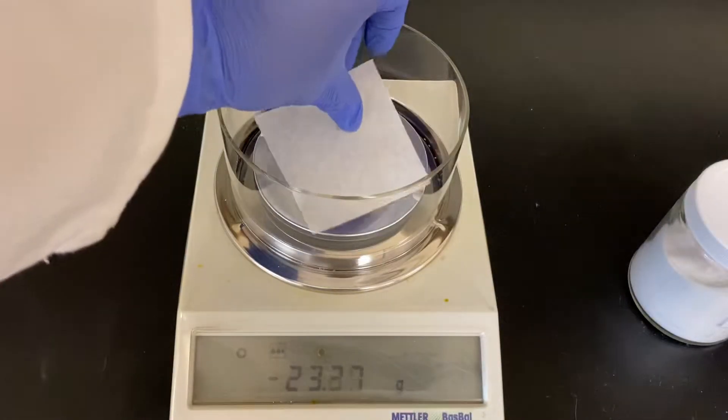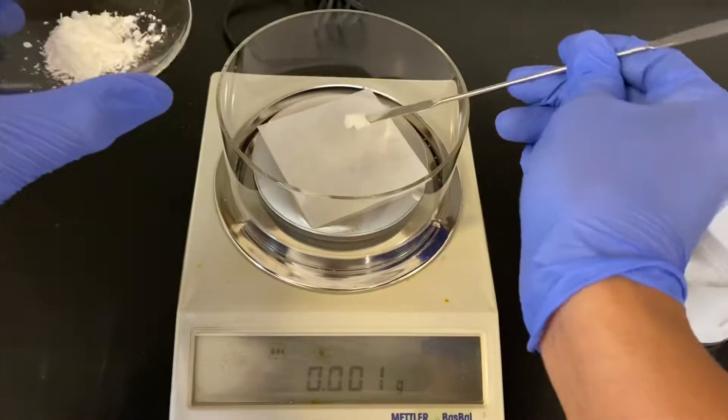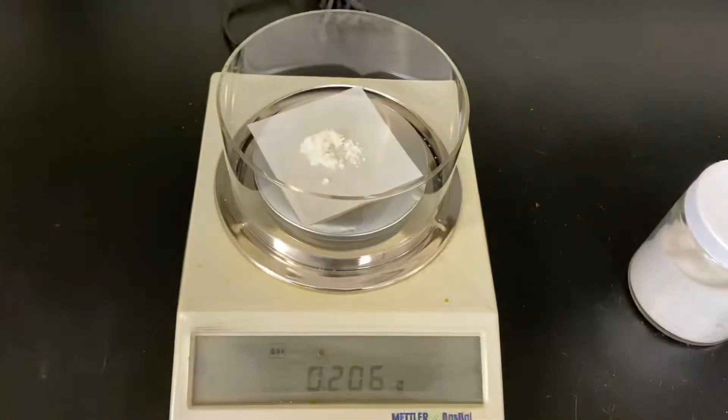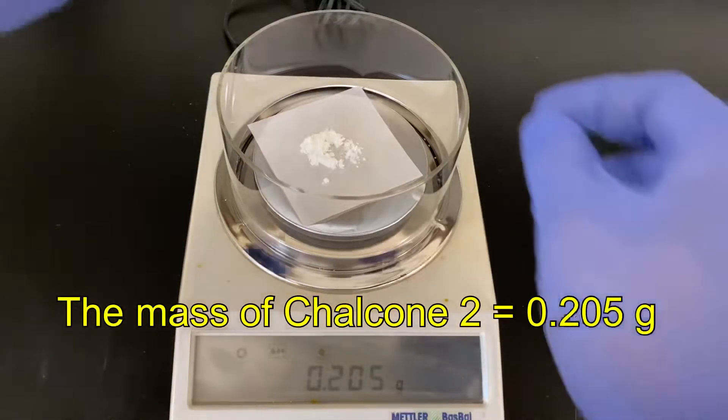In this experiment, we will reduce the substituted chalcone, which is synthesized in the first part of the experiment, using sodium borohydride. The amount of the substituted chalcone used in this experiment was 0.205 grams.